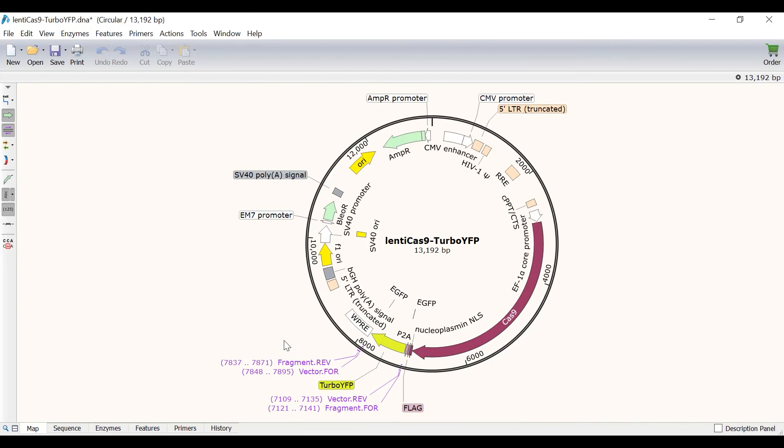In the map view you can see the newly designed primers in purple. And these primer sequences can be found in the primers tab. I can also select to show history colors, which will highlight in red where the assembly occurred.